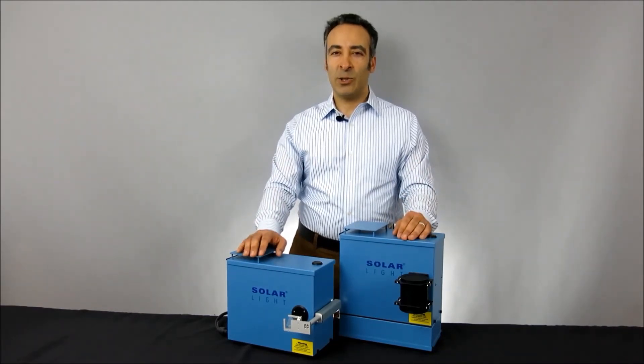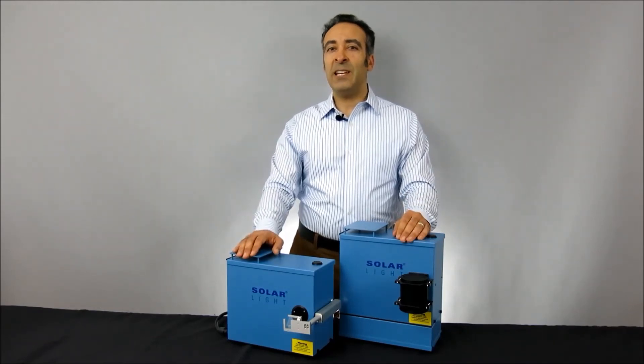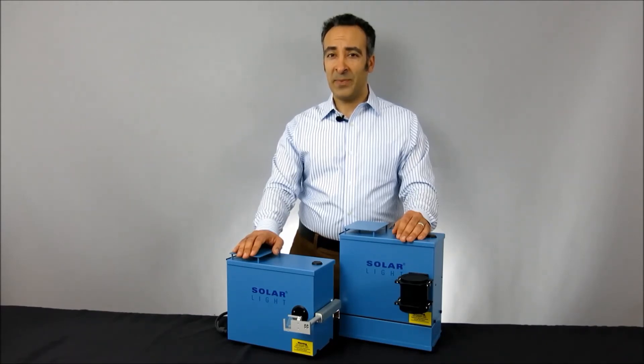The 16S-series solar simulators are available in both 150-watt and 300-watt variations, each using a premium-quality ozone-free xenon arc lamp to produce a 1–3 cm spot beam, depending on the application. Let's take a closer look at these simulators in greater detail.